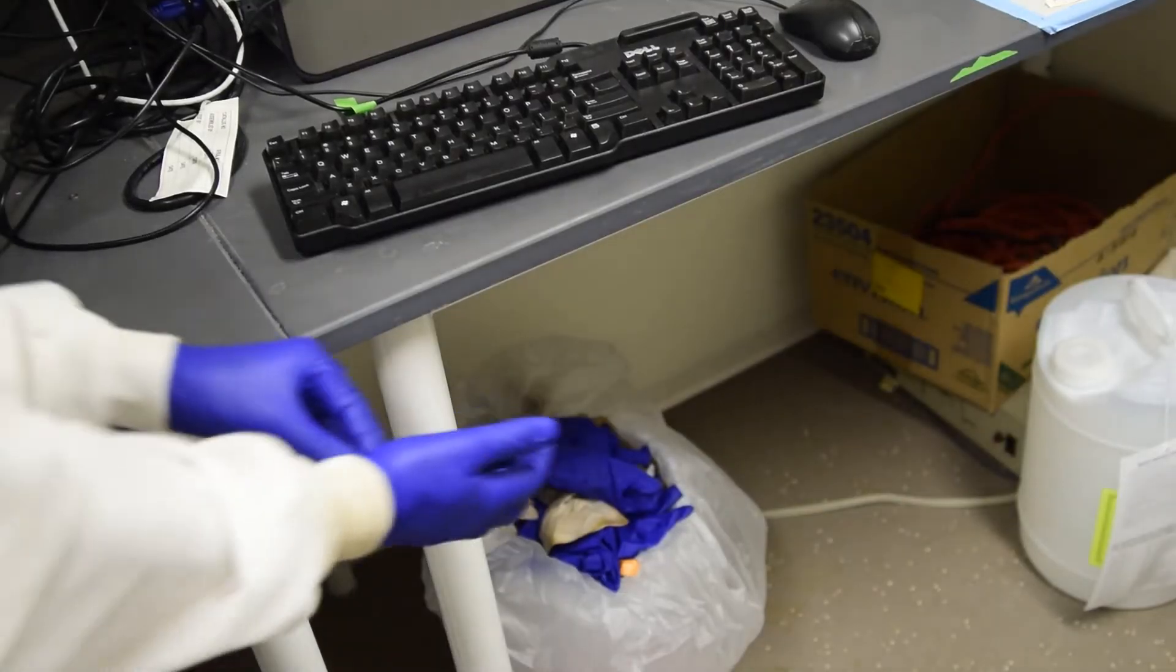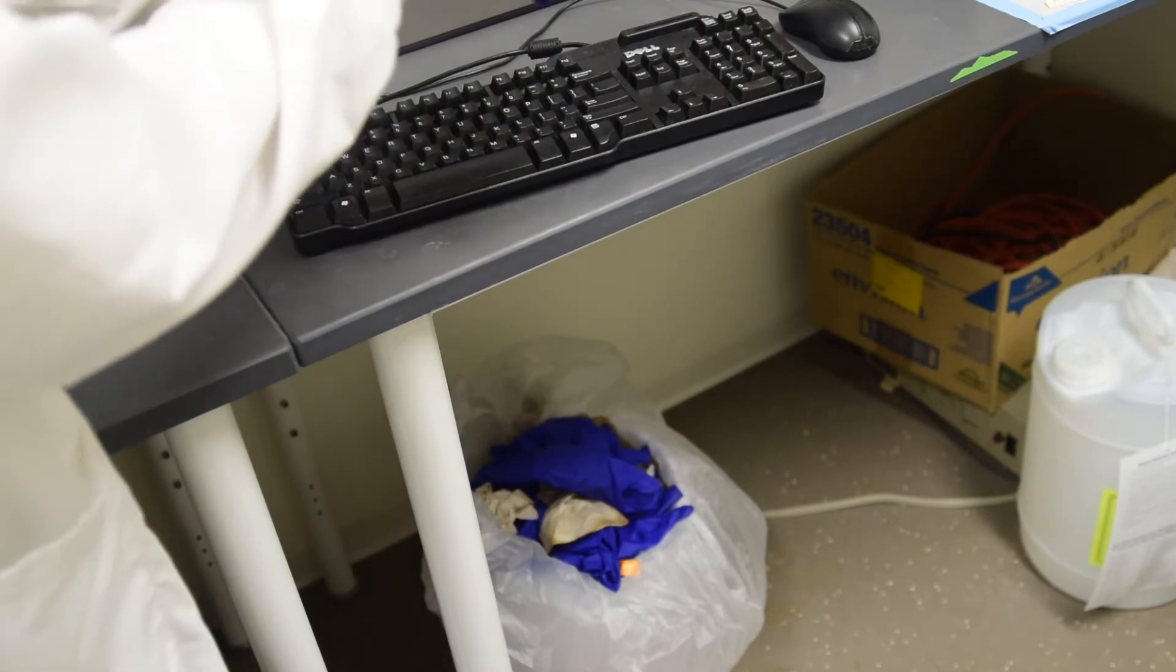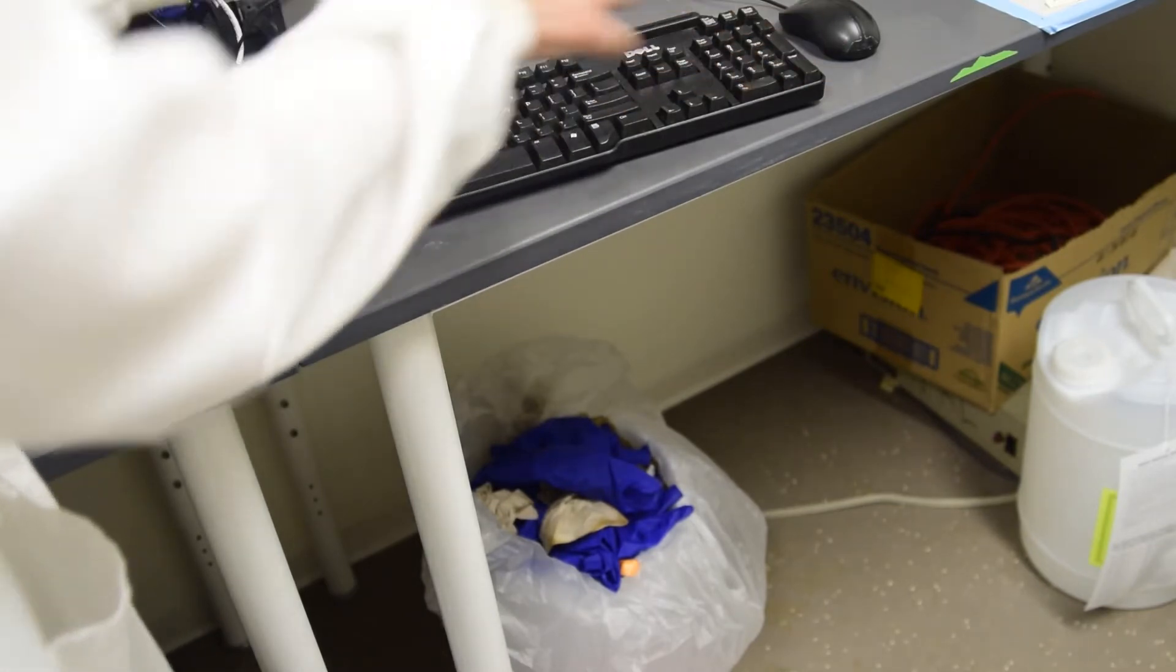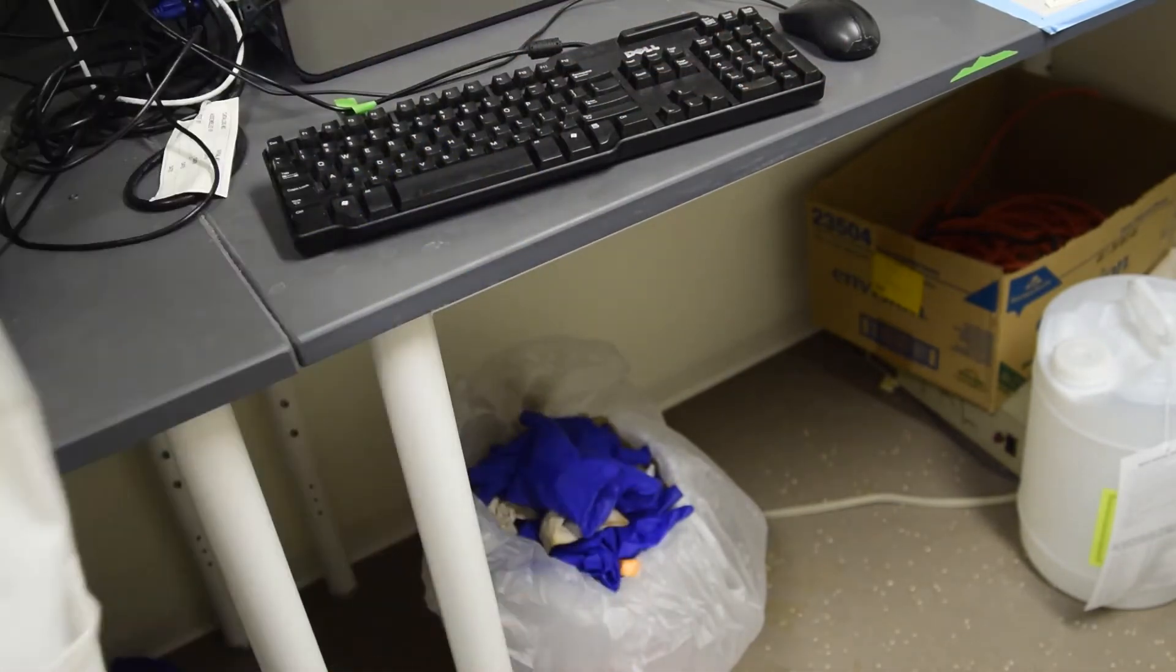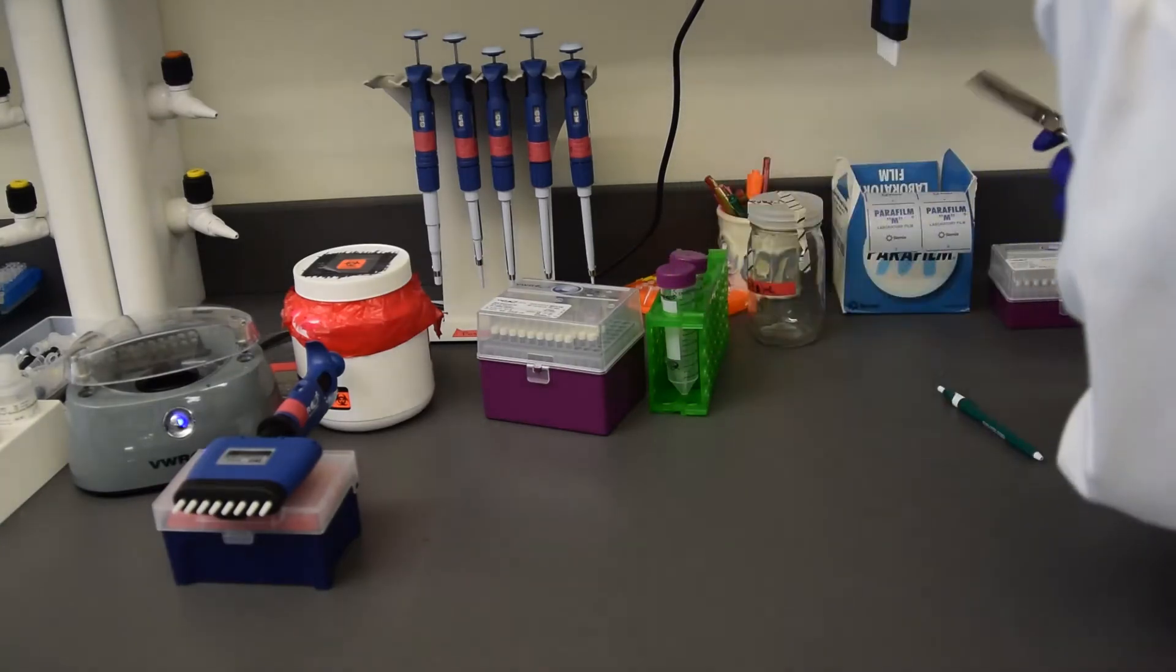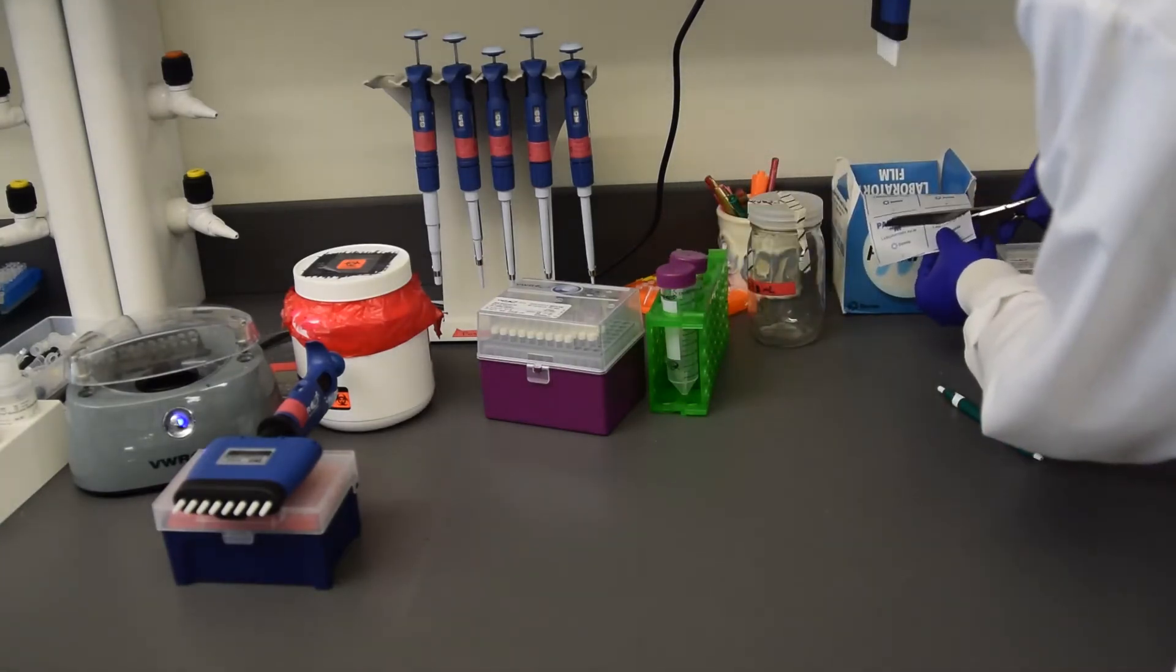Remove gloves carefully and place them in the ethidium bromide waste bin. Now we need the PCR product to load. Clean your work surface with ethanol and let dry.